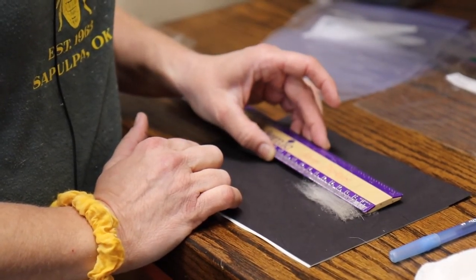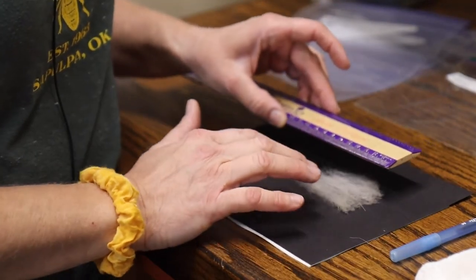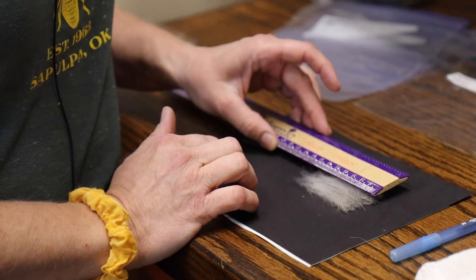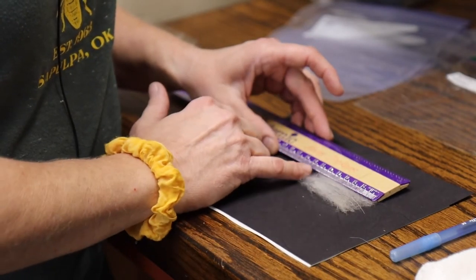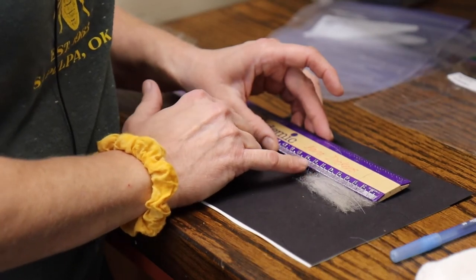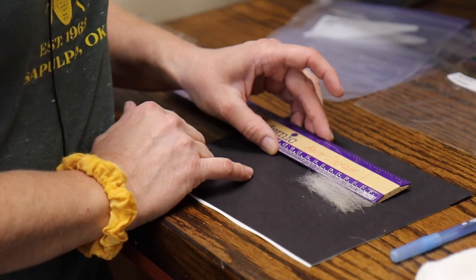Sometimes you can put your ruler on top if you're having trouble with the edge and the sample isn't as demarcated. You can start your ruler here, and you'll notice the cashmere is still going — the majority of it is still going at around the 67 millimeter mark.